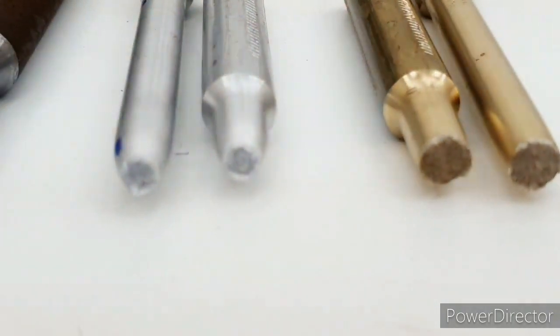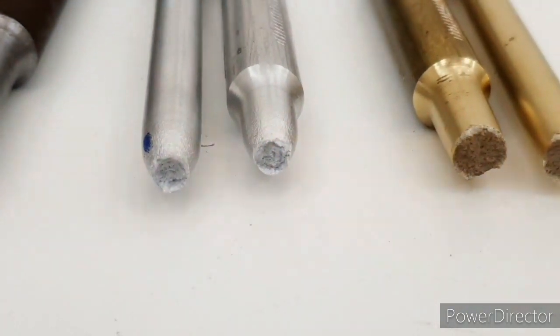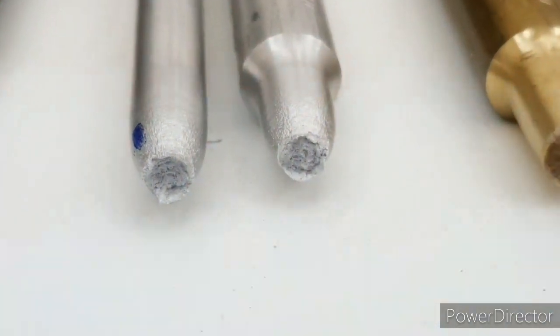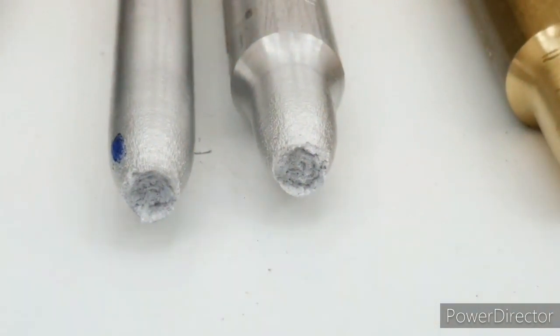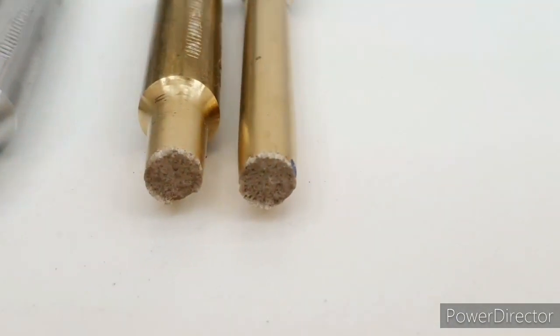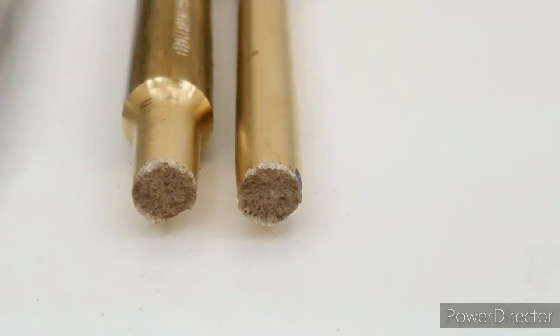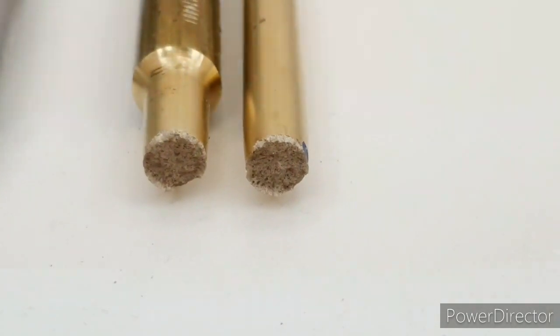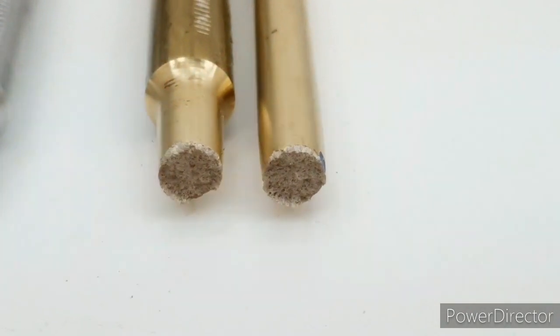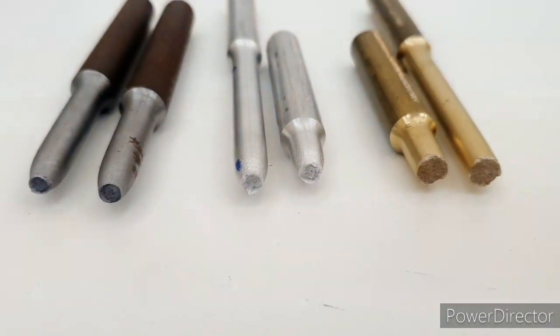Also the aluminum sample, which was here, has shown some good necking, and there is a cup-like structure happening in the failure region. You can see it carefully. While when we look at the brass sample, you can see the necking is very little, and the failure area is almost flat in shape. That's the difference between the three samples and their failure behavior.